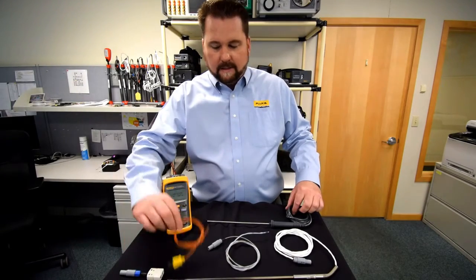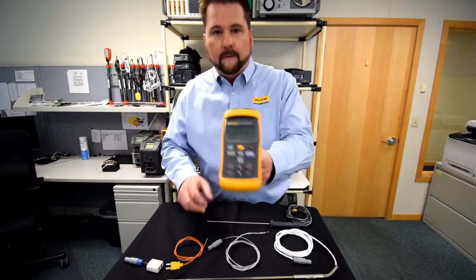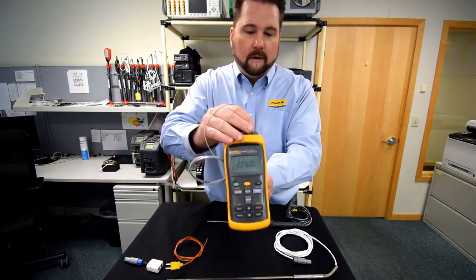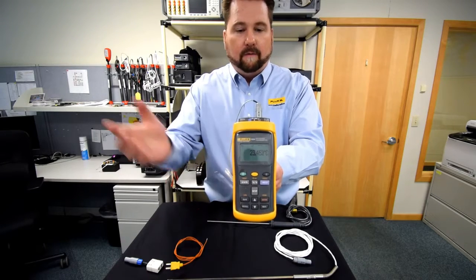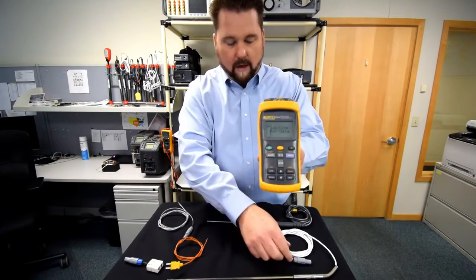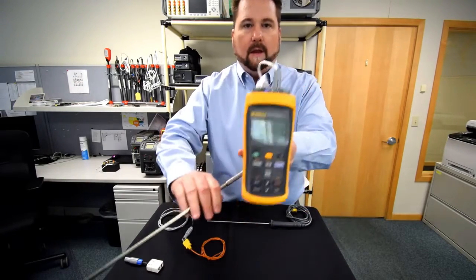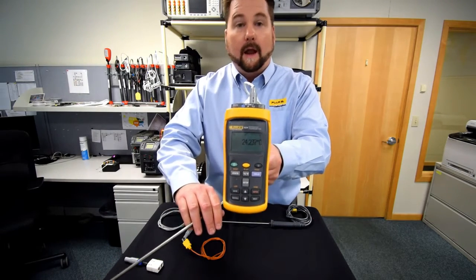Let me show you a quick demonstration. The unit is on and powered up. What I've got here is a thermistor probe — it's already pre-programmed. You plug and play and you're ready to go. Now if our application changes and we need to go to a higher temperature application where an RTD is required, I've got my RTD probe here. I'm going to plug and play as well — and we've immediately switched over and it's already reading at a higher temperature.